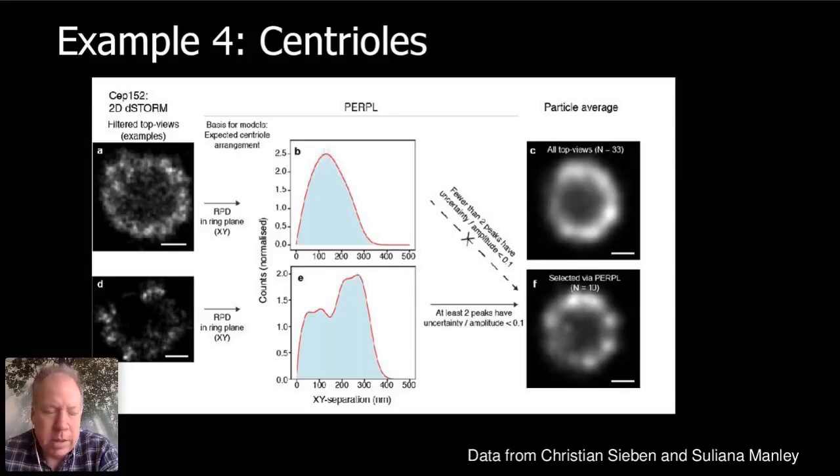So it's probably quicker than taking the data in the first place, then, isn't it? Yeah, it's pretty quick, actually. It's not hours or days. Like everything, it will depend on the size of your data set. But certainly, I've run the nuclear pore data. I've done an analysis on that with, I think it was about 30,000 localizations, and it took a few minutes.